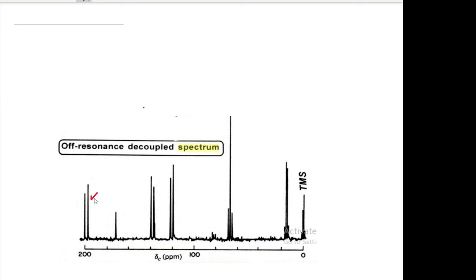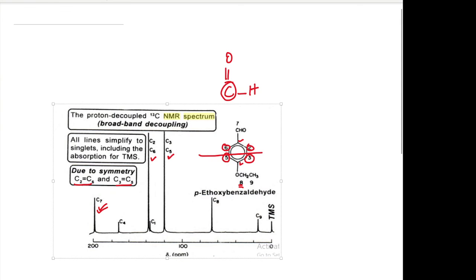So you can check all the carbons and how many protons are attached to it. You can look at the spectrum and you can just tell that. So if there are two protons, it will give a triplet. If there are 3 protons attached to carbon, it will give us a quartet. So it is very simple when you are used to this. You will practice a lot. So this is very simple.